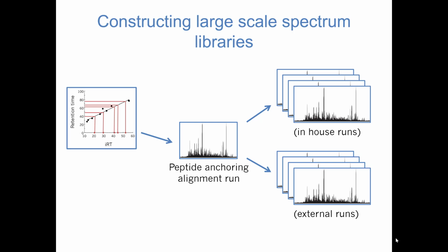I can even do that with external data too. So it doesn't even have to be run in the same lab. You just need the same peptides in those samples. Does that sort of make sense?